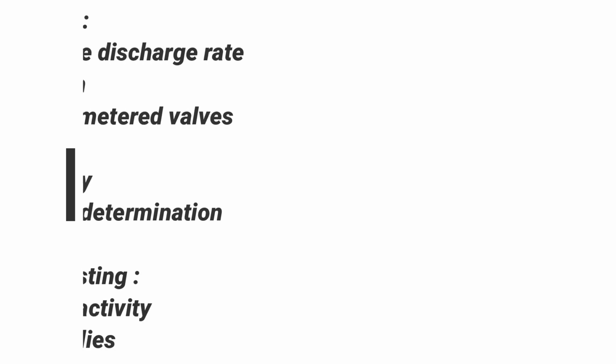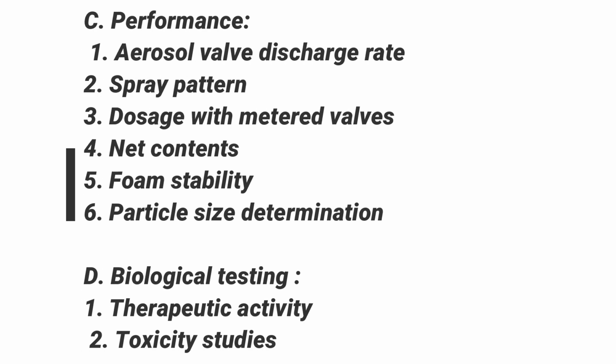Next, performance. In that, we again have different tests: aerosol valve discharge rate, spray pattern, doses with metered valves, net contents, foam stability, particle size determination, and finally biological testing. In that, therapeutic activity and toxicity studies we will check.